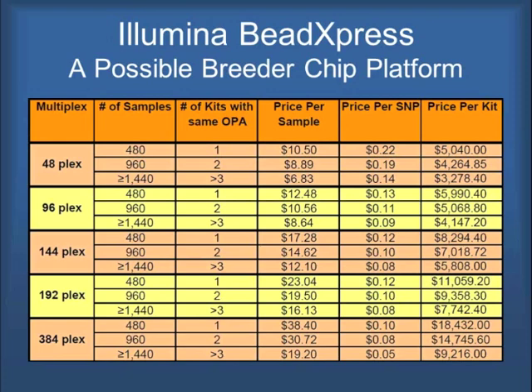I remember we were saying, well, after we develop some SNPs, we'll convert them back to PCR-based agarose gel markers that you could use. Well, I think that's kind of silly. The high throughput analysis is so much more cost effective. And there are different platforms. Illumina BeadXpress has a platform where you can have a 48 SNP system, a 96, all the way up to 384 that you can analyze. You can multiplex and analyze at one time. That's what we want to do.